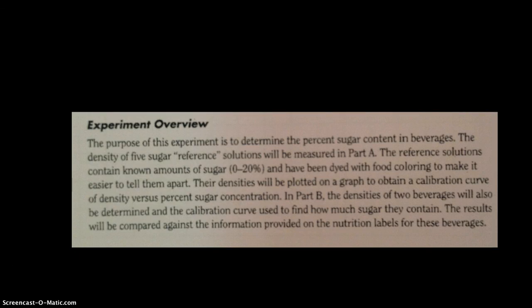The reference solutions contain known amounts of sugar between 0 and 20% and have been dyed with food coloring to make it easier to tell them apart. Their densities will be plotted on a graph to obtain a calibration curve of density versus percent sugar concentration.